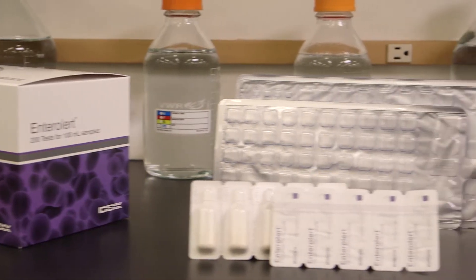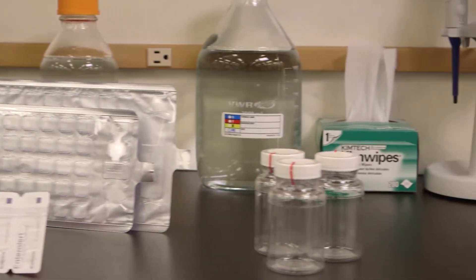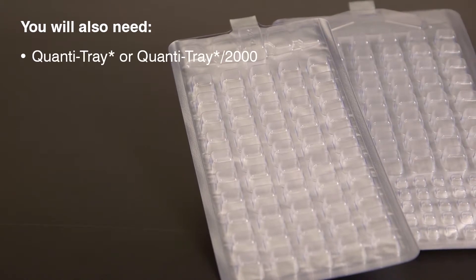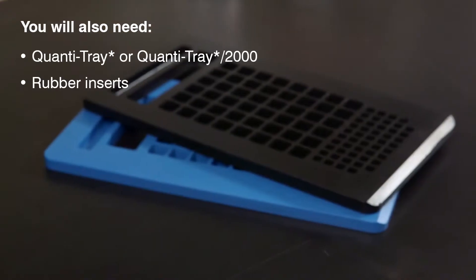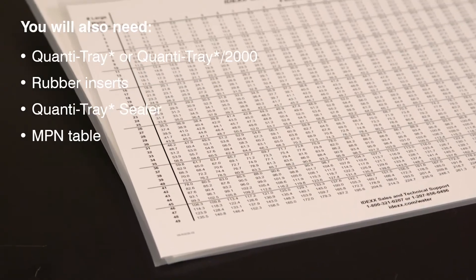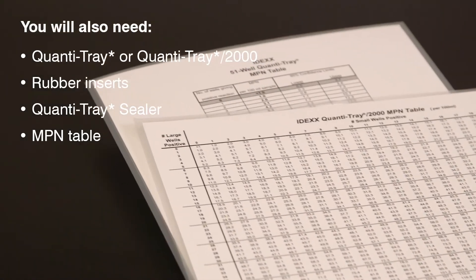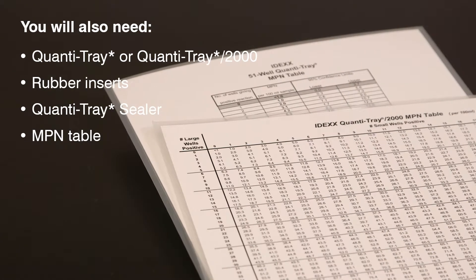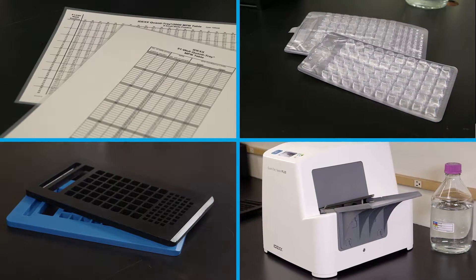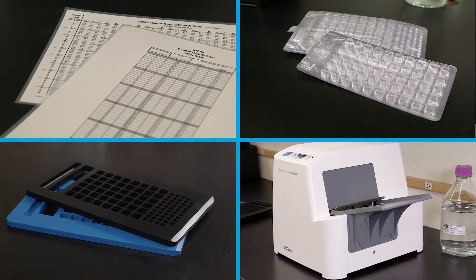In addition to the materials used for presence-absence detection, for quantification you will need a Quantitray or Quantitray 2000, Quantitray rubber inserts, a Quantitray sealer, and the included Most Probable Number Table or the IDEXX Automated MPN Generator Program found at IDEXX.com. All of these items are included in the Quantitray system and are available from IDEXX.